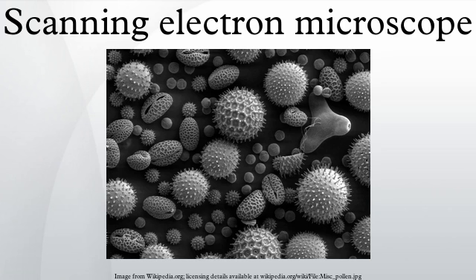Environmental SEM instruments place the specimen in a relatively high-pressure chamber where the working distance is short and the electron optical column is differentially pumped to keep vacuum adequately low at the electron gun. The high-pressure region around the sample in the ESEM neutralizes charge and provides an amplification of the secondary electron signal. Low-voltage SEM is typically conducted in an FEG SEM because the field emission gun is capable of producing high primary electron brightness and small spot size even at low accelerating potentials.